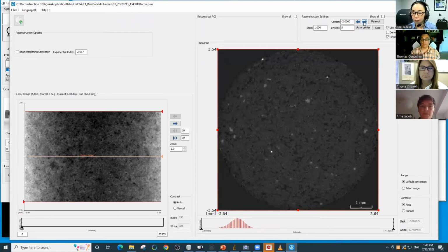All right. Well, thank you, Arn. Aya, your scan is done. Is that correct? Yeah, the scan is done. Okay, we'll hold off on the next couple of questions until the end. Very good. All right. Okay. Thank you.